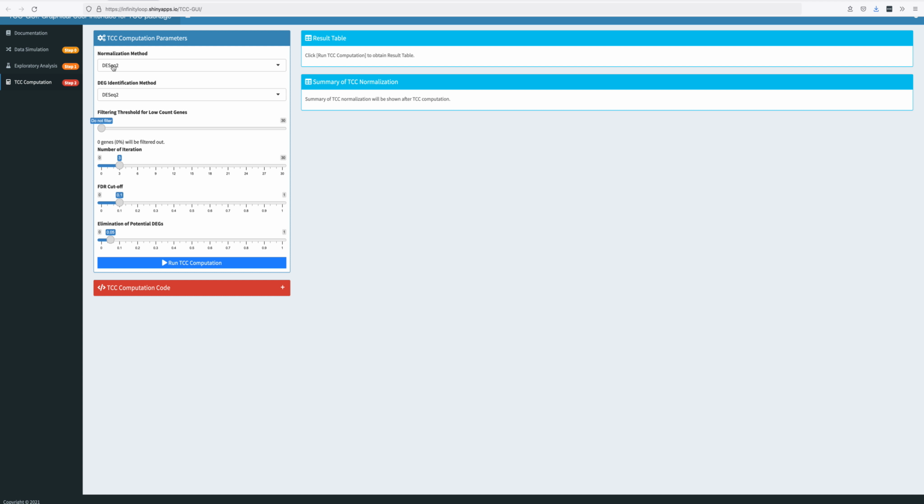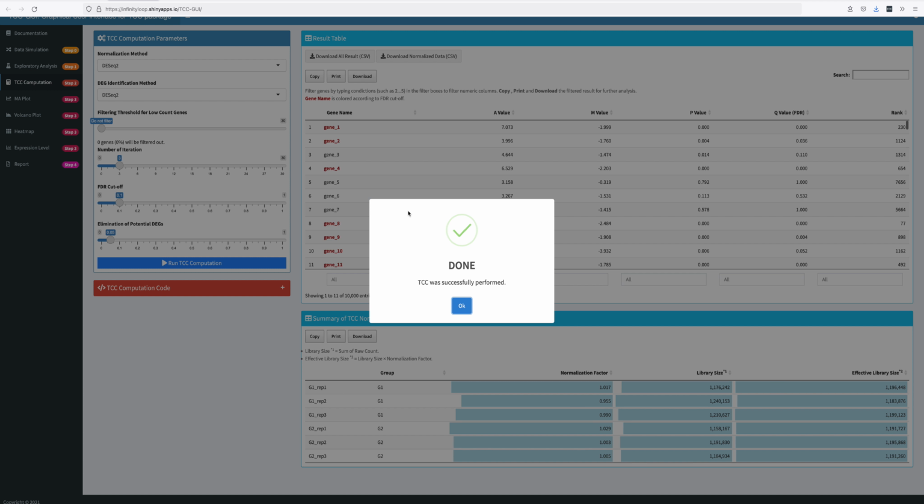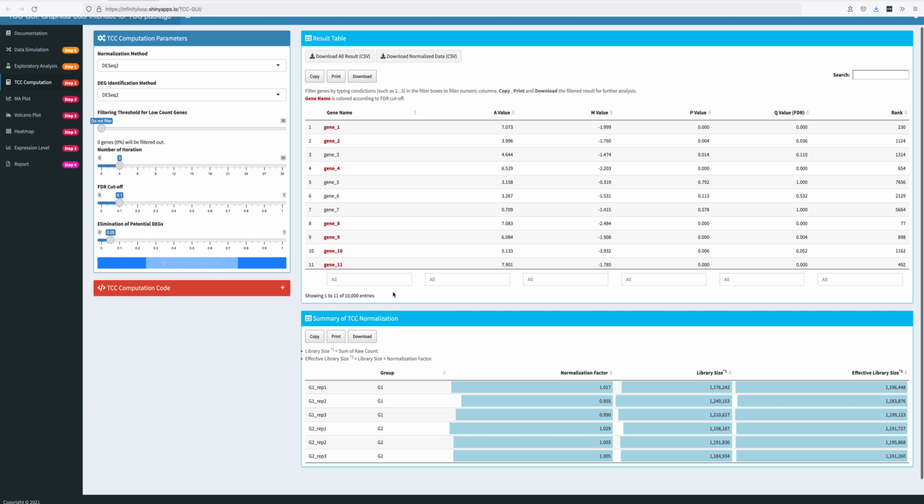analysis, differential expression analysis. We can use different methods, which TCC is a pretty popular one, to get the differentially expressed genes, and we can have filtering and stuff like that, but we go with default, and then it takes some time to do differentially expressed gene analysis with TCC, and let's see when it's going to finish. And it is done. So we have now the data.